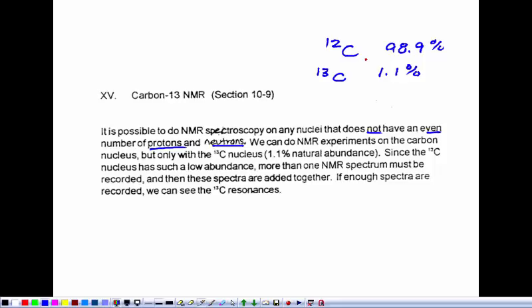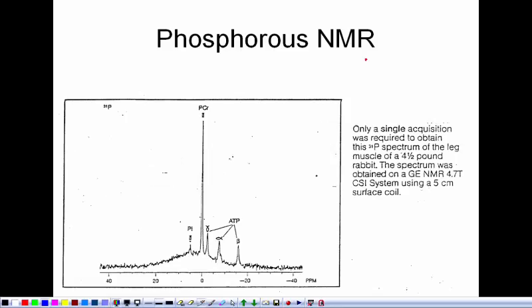Didn't mean that those instruments didn't exist. It meant that we didn't have one. Now, on our instrument next door, I can get a carbon-13 scan depending on how much stuff I have. But I could definitely get one in 5 minutes or an hour or 2 hours. Okay, so we can do more than just protons. So carbon-13 we'll talk a little bit about, and then over the next weeks we'll do a little more practical stuff with it. But just to show you some examples of some weird stuff that people have done.